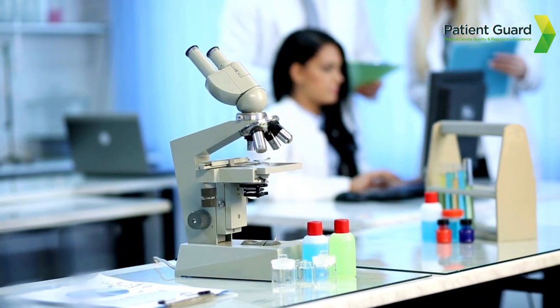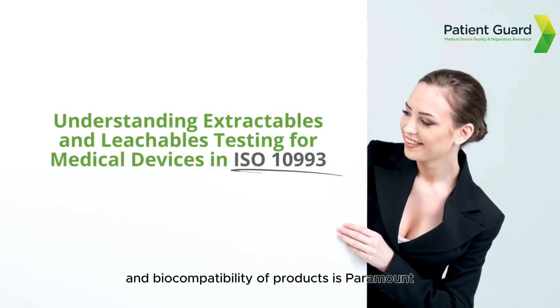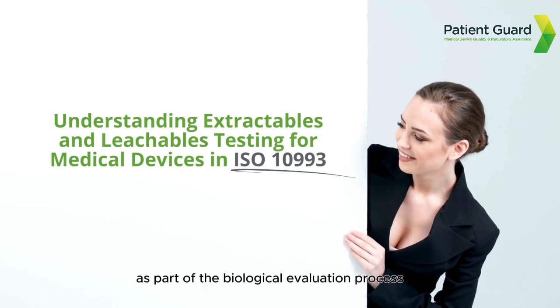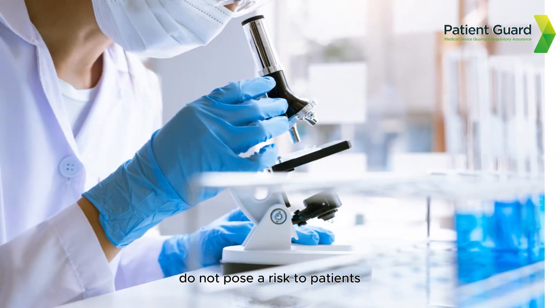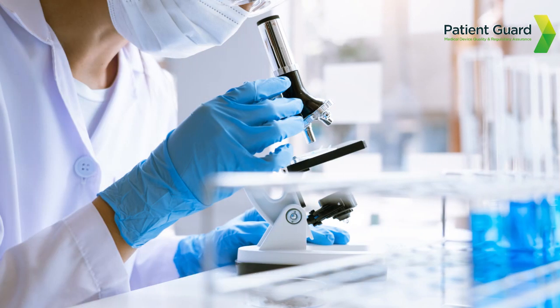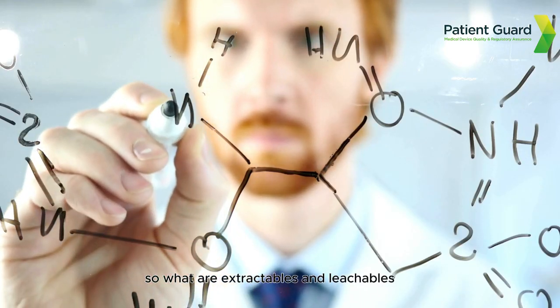Let's dive in. In medical device manufacturing, ensuring the safety and biocompatibility of products is paramount. As part of the biological evaluation process, extractables and leachables E&L testing is essential. This testing ensures that any chemicals that might migrate from the device materials into the body do not pose a risk to patients. The ISO 10993 standard series provides comprehensive guidelines for the biological evaluation of medical devices, including protocols for E&L testing. So, what are extractables and leachables?